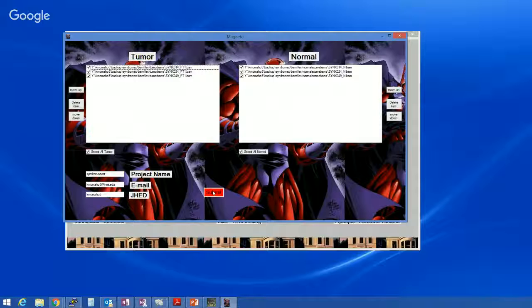And that's it. It is going to move these files over, and Magneto will stay open until those files are moved over. But now you can go home. It should email you once your analysis is done, with where your results are, how to get access to them, and what to do next.